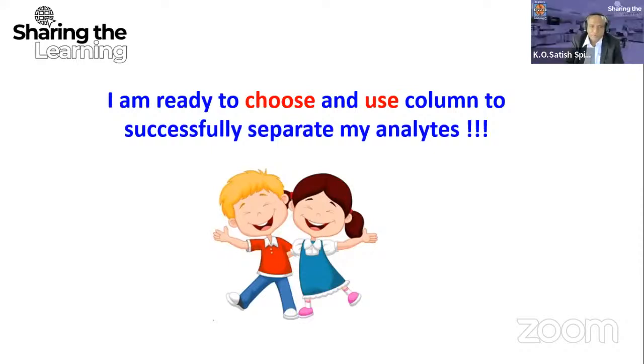So there's another query from Mr. Nishant Ahar, again asking how to regenerate the column. Probably we are going to cover that in the next webinar.